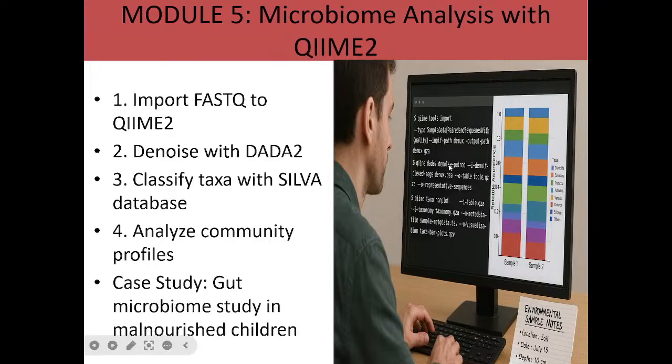And when you look at the picture, you will see it's not just ordinary color. All those colors are standing for something unique. So, for example, what that one is doing is microbiome analysis.